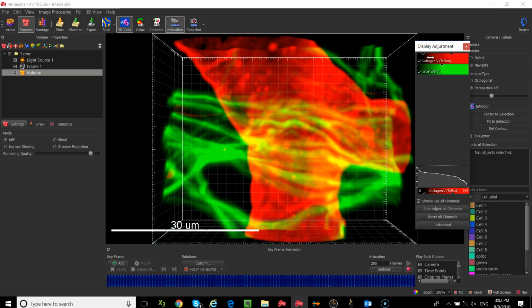So the gamma, the brightness, and the background, all three of those change how the data is visualized, but the underlying data is exactly the same. So the intensity values are not changed. This is purely a change for display, not intensity. Okay? So now that we know that we have controls for display.